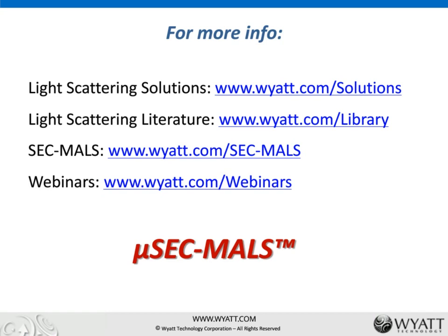Okay, and someone would like me to clarify, is microDAWN more sensitive than Helios? I think in terms of the concentration sensitivity, they are comparable. They're the same.